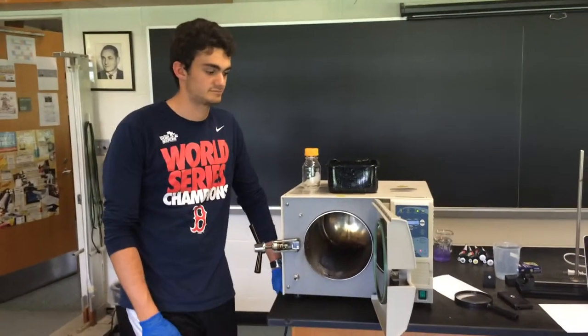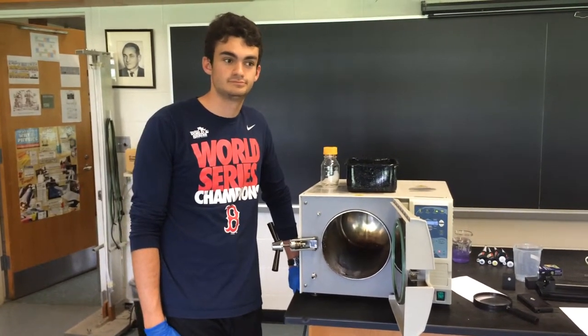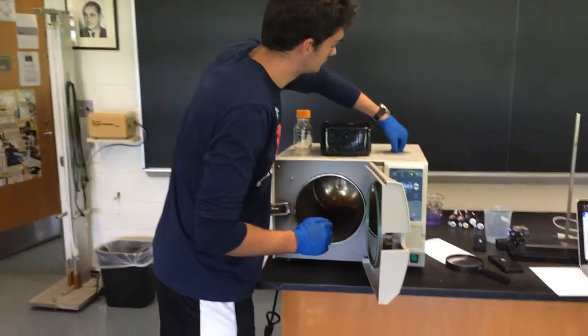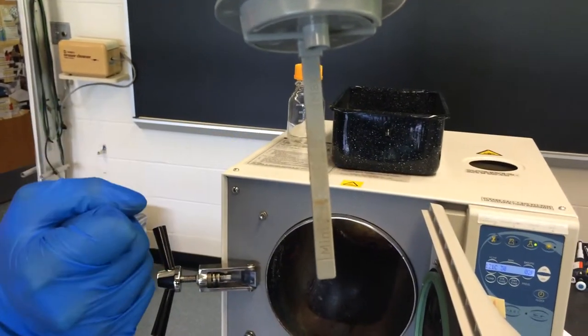Now we're going to go over a step-by-step process of how to use the autoclave. Before starting the autoclave, make sure to check that the water line is between the min and the max. You can see where the gray stick is at the top of the autoclave.